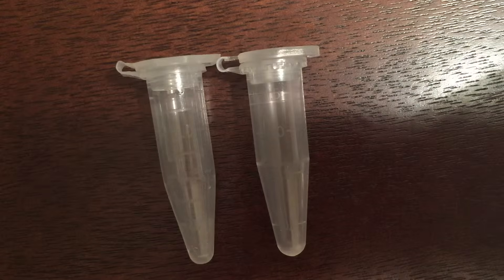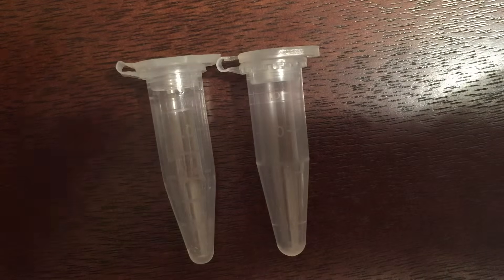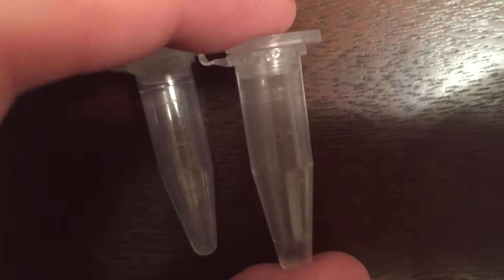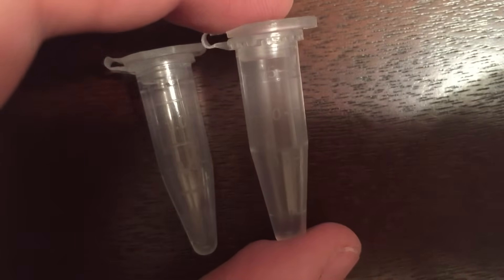You'll see right in front of us two micro centrifuge tubes that we carry. Both are graduated to 1.5 milliliters and at first glance look very similar. However, you'll notice that this Brandtek tube on the right actually has a little bit of space above that 1.5 milliliter graduation mark.